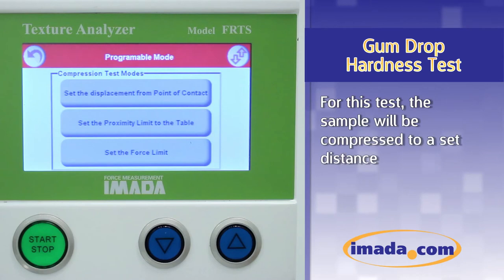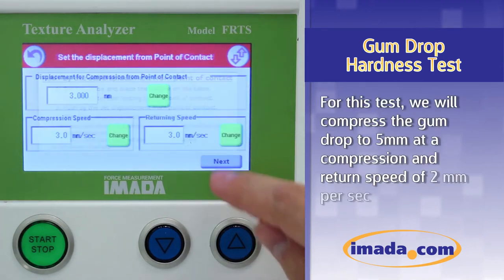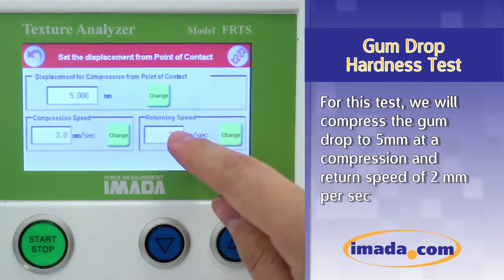For this test, the sample will be compressed to a set distance. On the next screen, the test parameters are set. For this test, we will compress the gumdrop to 5 millimeters at a compression and return speed of 2 millimeters per second.